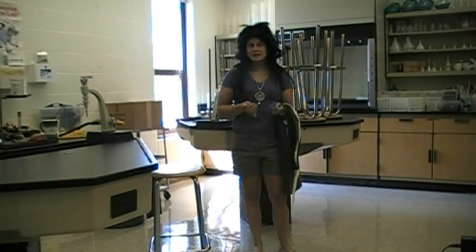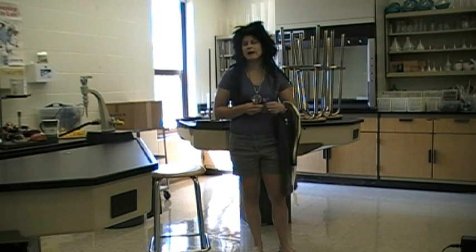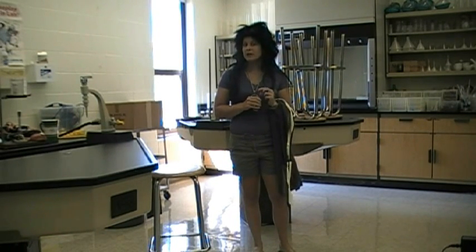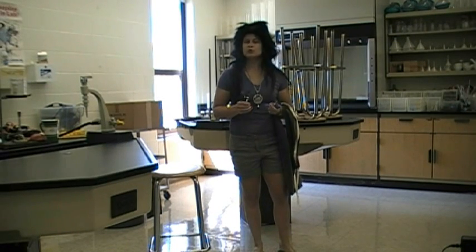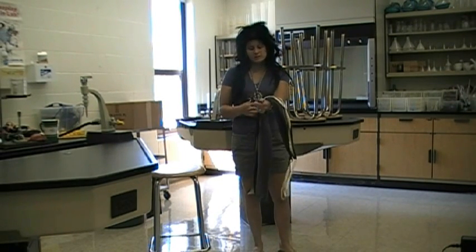Hi, I'm Ms. Carrie Less, and as you know I've been asked by your teacher to come in and demonstrate proper lab procedure. Now I think I'm going to be pretty good at this, so you should probably take notes. It's going to be fun.